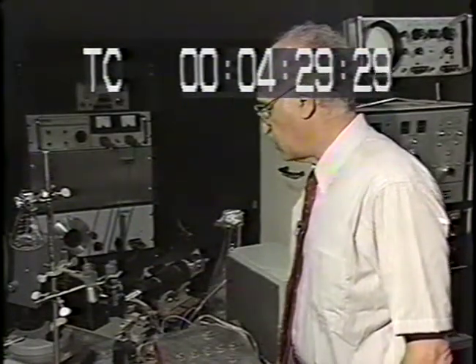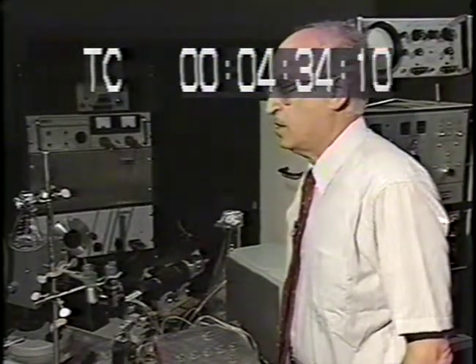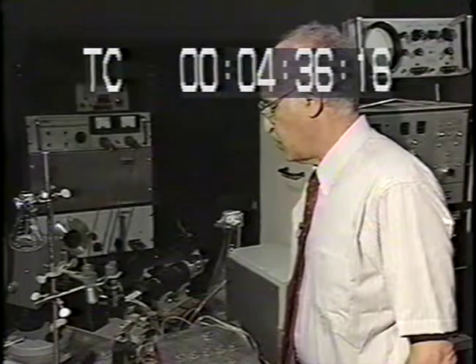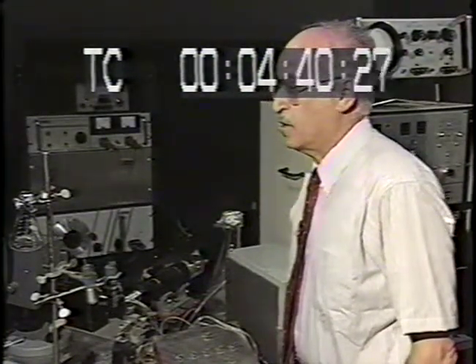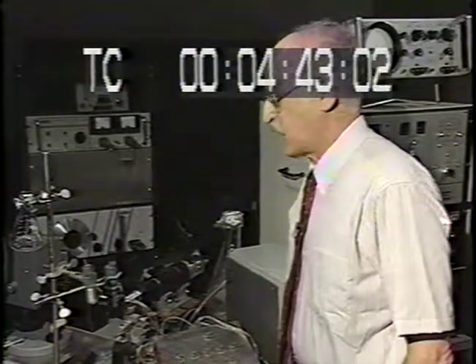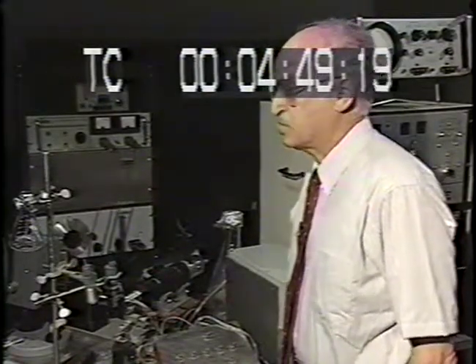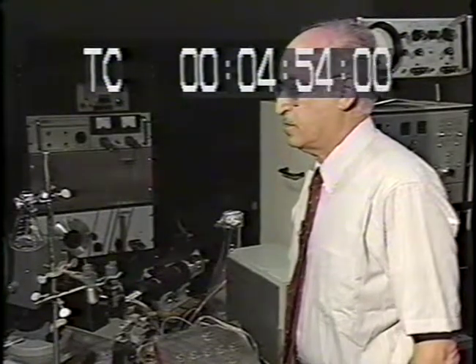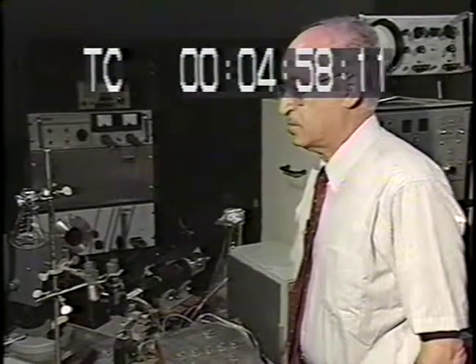The last time I used it for experiments was in 1981. My major work has been on doing viability studies for measuring antibody effects on cells, like killing antibodies, cytotoxic antibodies, things like that. Could you give us a brief tour of the instrument and maybe just point out some of its major parts and features?